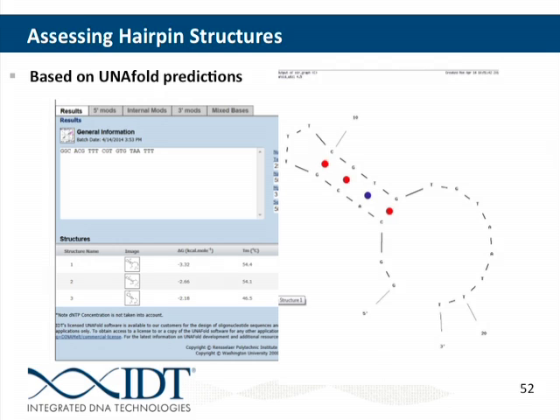And here's one at minus 6. It doesn't look stable. However, this right here is the most dangerous possibility. It has a danger of exponential amplification. So even though that number is only negative 6.3, this is something that I would worry about and most likely redesign the assay to avoid. Because even 1% or less than 1% of this, when amplified in your reaction, could be very problematic.